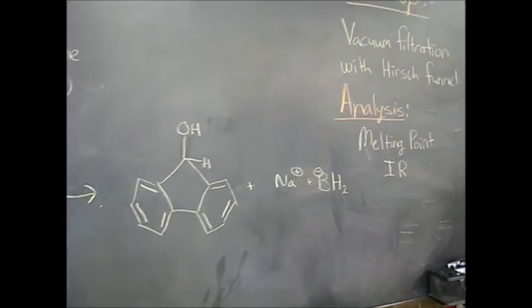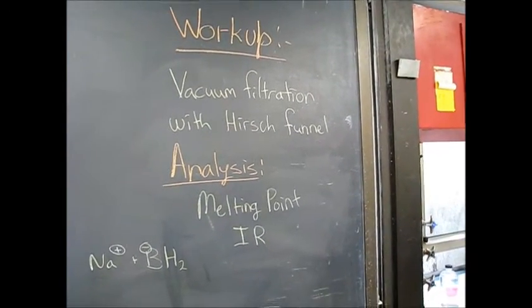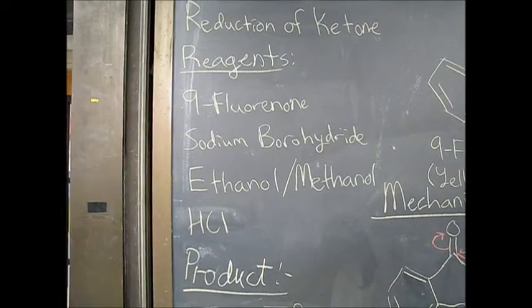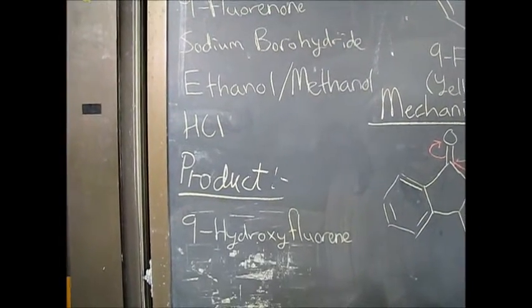And then to work up the reaction, we're just going to do vacuum filtration to get the solid out. And then for analysis, we'll do melting point and IR. Also, we will be using methanol and HCl as part of our workup method, just to clean out all of the byproducts. I believe that's everything.